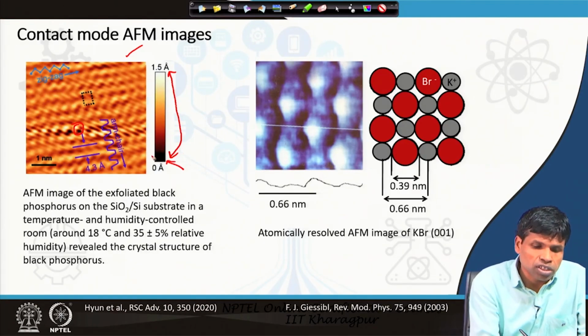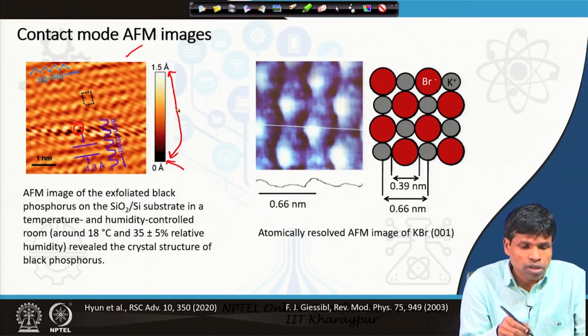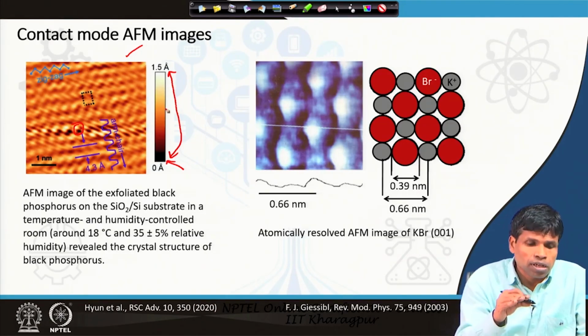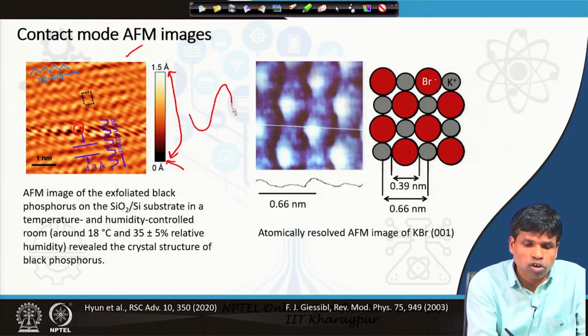So, by measuring this brightness contrast, we can know the lowest part or deepest part in the sample surface, and the tallest parts in the sample surface, the bottom height and top height. The brighter portion is the top height, and this is the darker portion in the image.